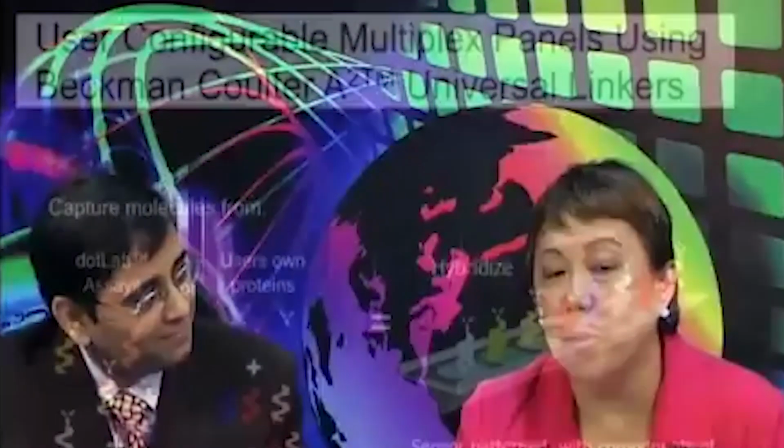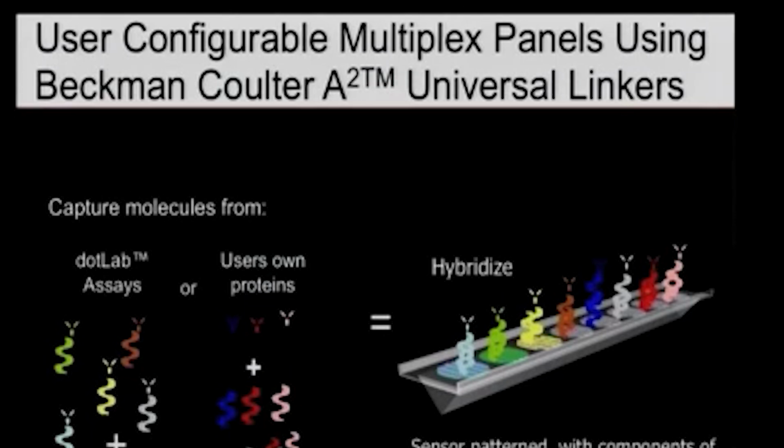Let me just show you how we actually did multiplex. I kind of glossed over it. I said there are 8 spots in there. But putting 8 different proteins on a piece of glass slide in a pattern is actually non-trivial. You can do it by physically doing them one by one, but that becomes very, very expensive and prone to errors.